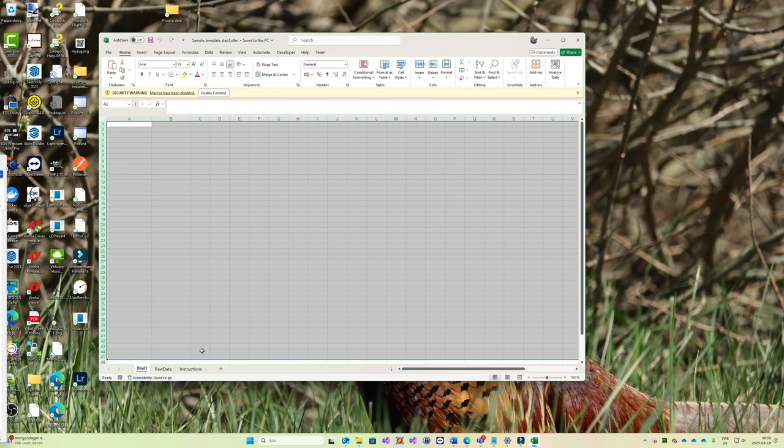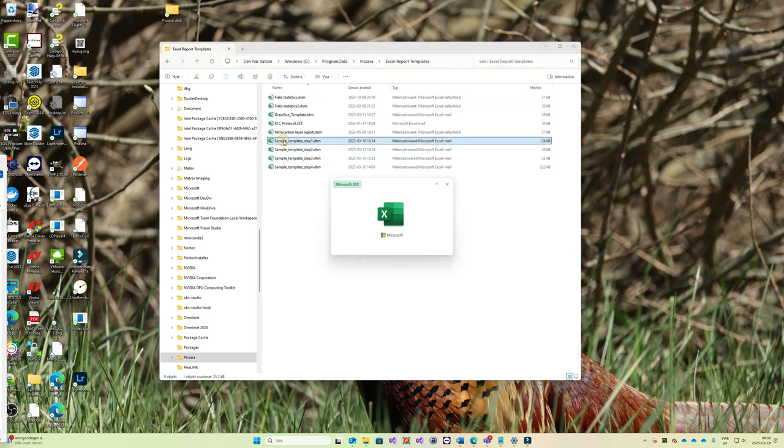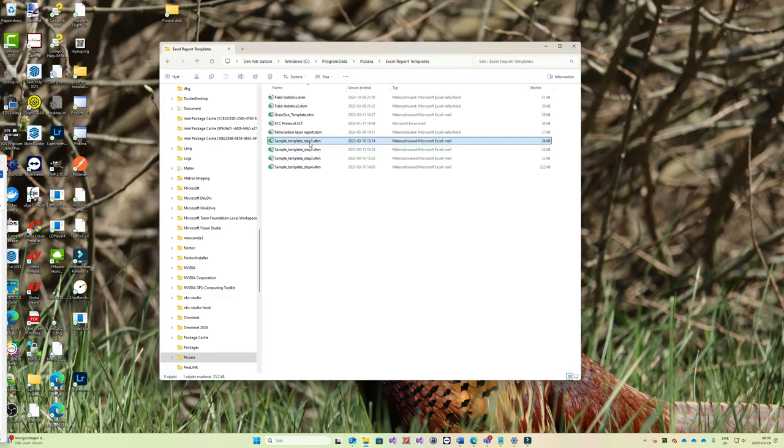One tip is template files are always with the same name. So in this case, step 1. But a document created using the same template will add a number after it. It's maybe a little bit inconvenient here, but if I open it, it will be named 11, and that is because it added 1 to the end of the file name. Next one will be called 12 in this case. So maybe I should have chosen another thing than 1 at the end.